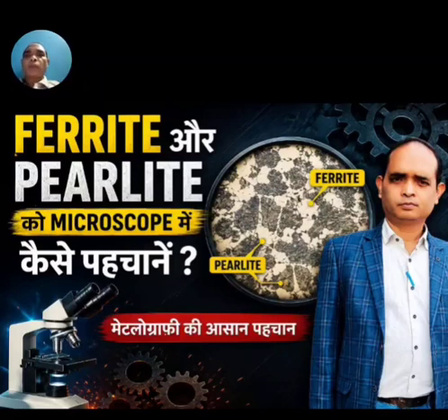A simple rule to remember is: bright regions indicate ferrite and dark colonies indicate pearlite. Always examine several fields of view before making your conclusion, because the microstructure may not be uniform throughout the specimen.